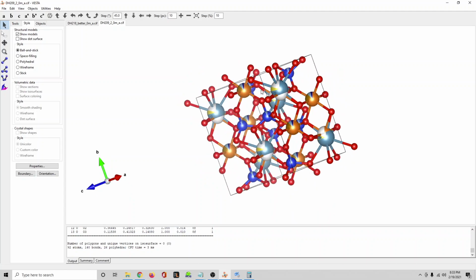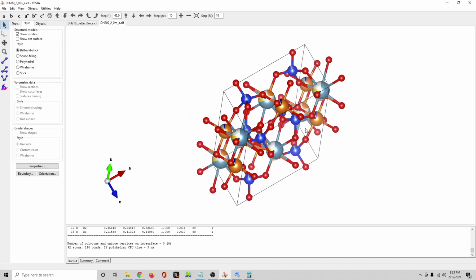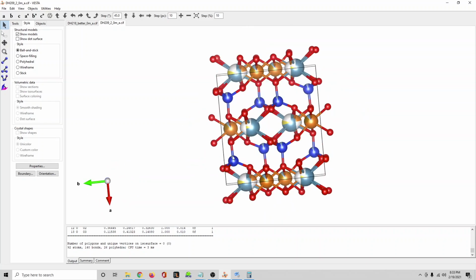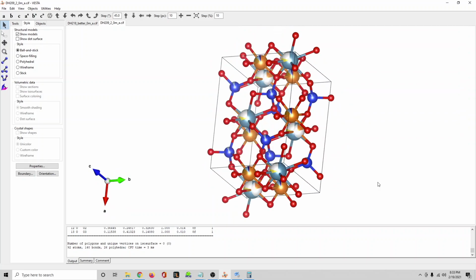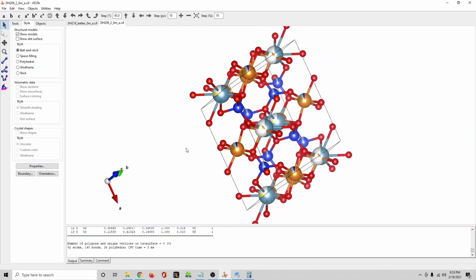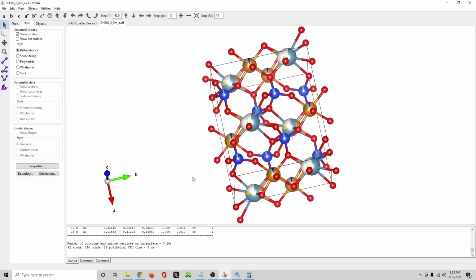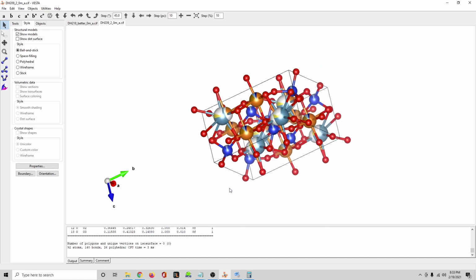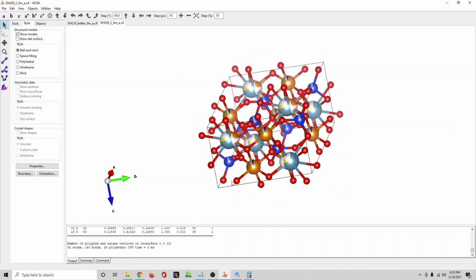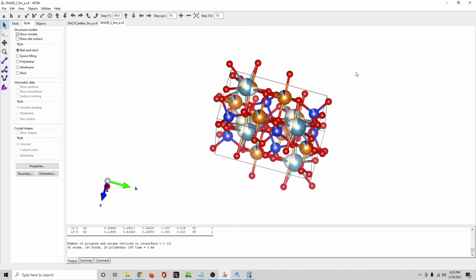And you can see that it's split between a bunch of different stuff. Everything is split. This wasn't the best collection in the world. If I had chosen a better crystal and stuff, we could have gotten a lot better. But this is how you do chemical data. Use chemical data in your refinements on ShelX.